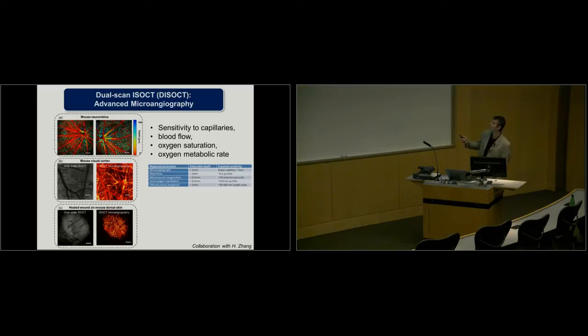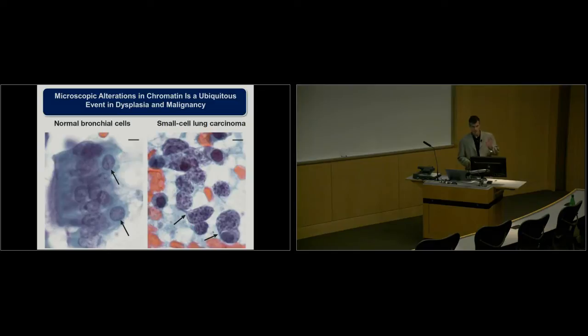A few more images, you see this beautiful pattern of vasculature. As it currently stands, ISO-CT is the world's most advanced microangiography technique that exists today, like I said. Very, very sensitive. So now let me switch gears a little bit and show this figure.